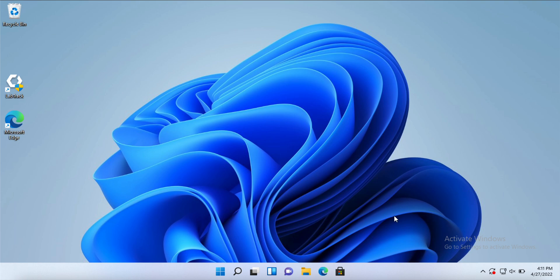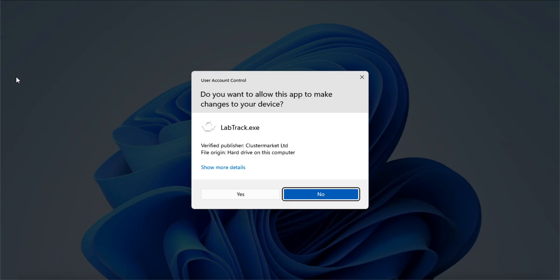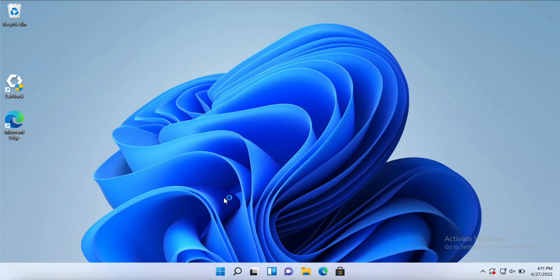Hi everyone and welcome to this quick video on how to set up our desktop app, also known as LabTrack. After you have downloaded the installer from the website and installed the app, what you need to do is execute the application, allow it to make changes to the PC, and then you will see the pop-up screen.